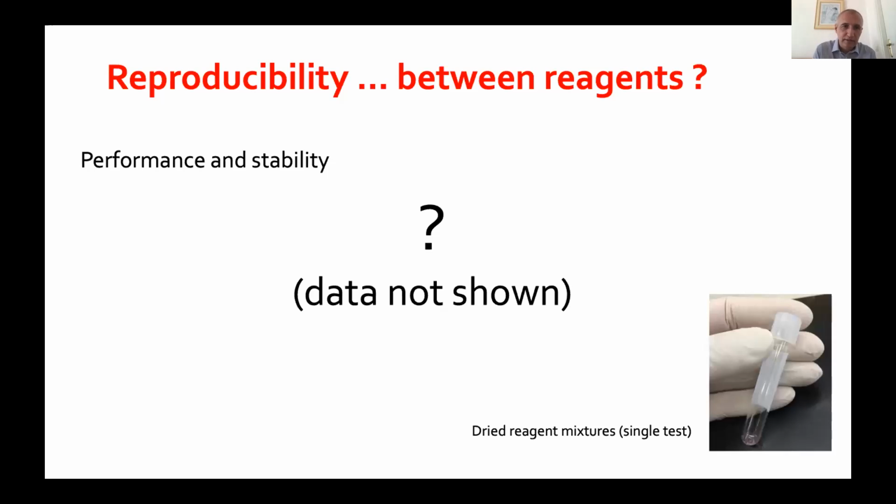And the better stability and performance, or better stability, is achieved mostly with the dried reagent. So this is probably a future of the clinical and standardized cytometry, to use the dried mixtures.